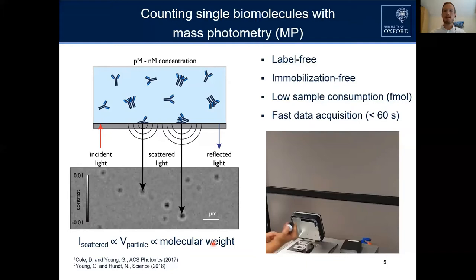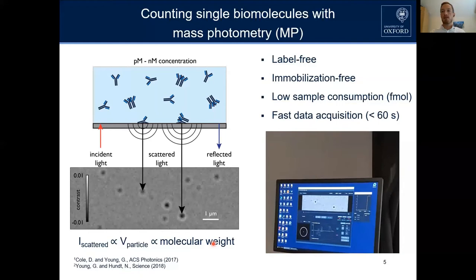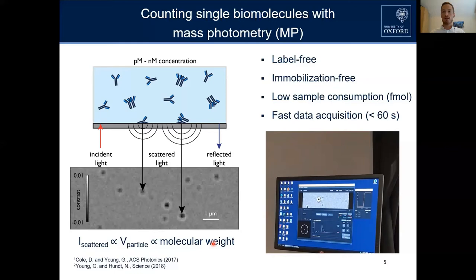To give you an idea of how simple these experiments are, here is a video showing the sample injection, after which we directly start our measurement where we see single proteins landing on the glass-water interface. We have already characterized many of these in two previous papers.